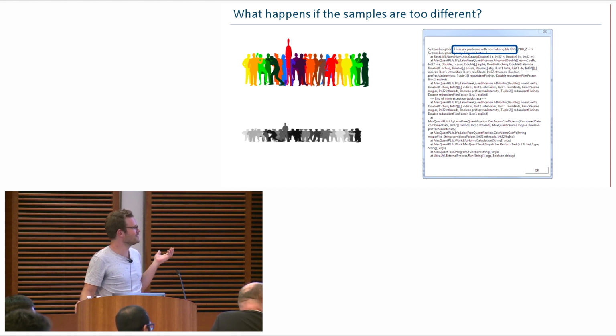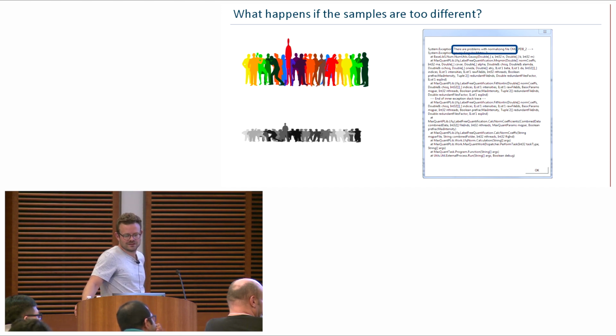So there's no missing data, I would say. Maybe I'm missing something. We'll talk offline. Maybe just to clarify: because we're restricting ourselves exactly to those peptides where, in the pairwise comparison, both are there, we avoid the missing value problem, basically.